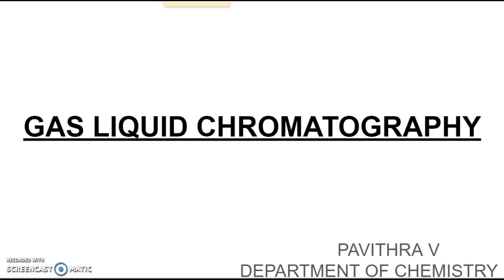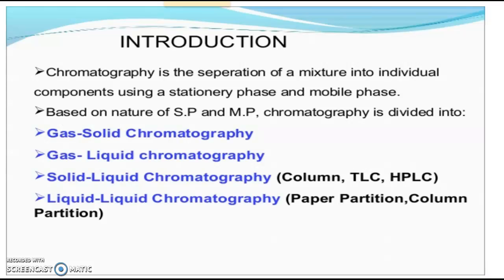Today we are going to discuss a topic called gas liquid chromatography, that is GLC. First we will see the definition of chromatography. Chromatography is a separation technique of a mixture into individual components using a stationary phase and a mobile phase.